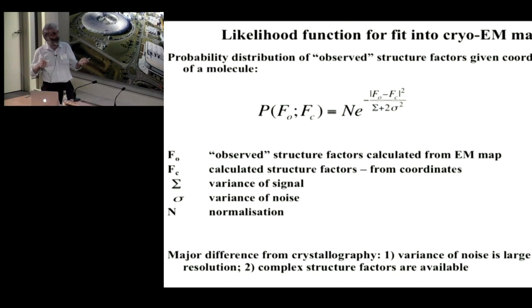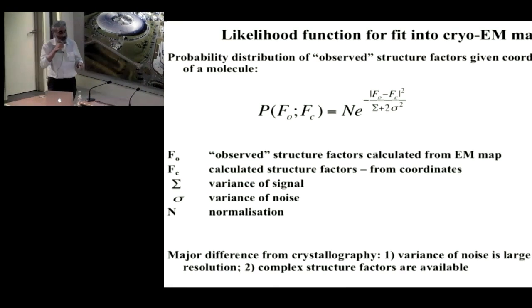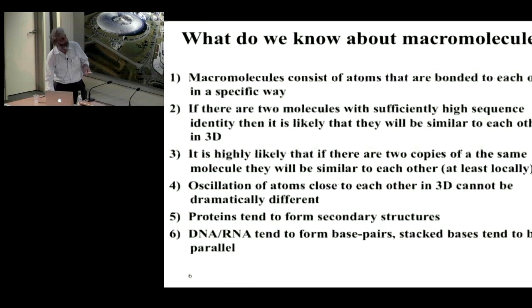So phases and amplitudes should be considered together. They cannot be considered as two different components. That's basically what is the fit of the model into the map.